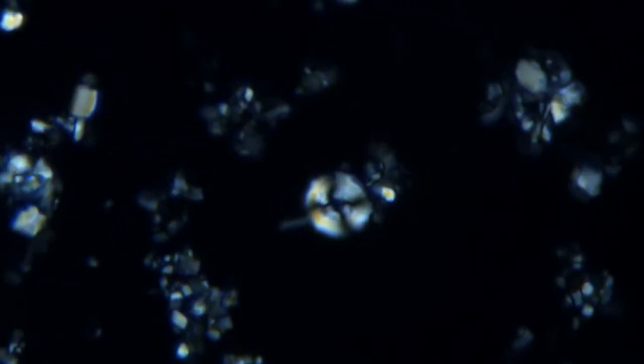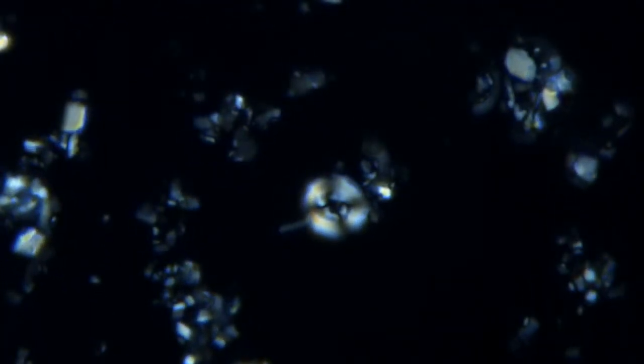Many calcareous nanofossils are composed of R units, meaning, as we saw in the previous video, that crystallites have their optical axis in a radial arrangement relative to the direction of propagation of light, which, as you know, travels vertically along the microscope until it reaches our eyes or a digital sensor. But many others have a more complex arrangement with a combination of both R and V units.